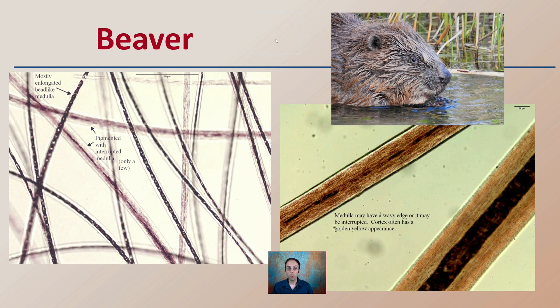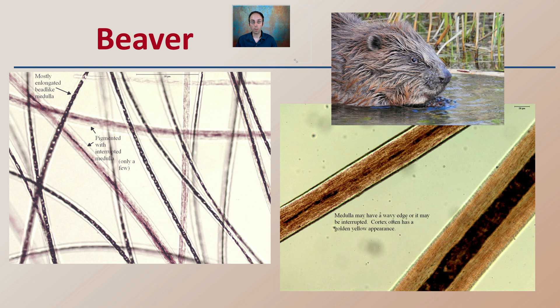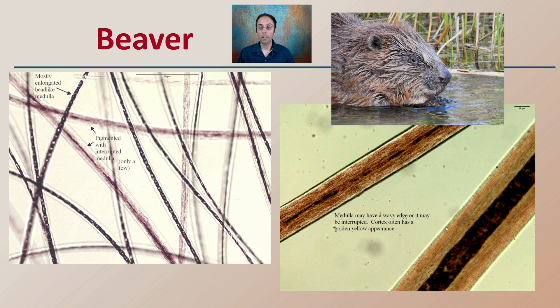We also have the beaver here. We can see some differences between the beaver and the woodchuck. While initially they look like brown hair from very similar organisms, looking at the hairs under the microscope, we do see some differences. It's important to look at those details so you're able to classify whether that hair is from a beaver or a woodchuck.